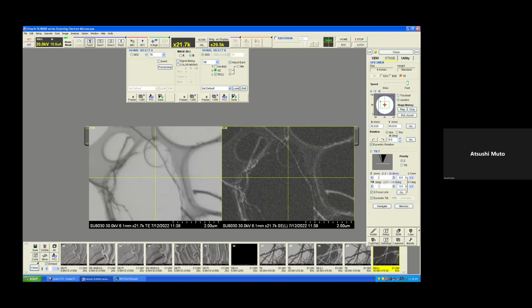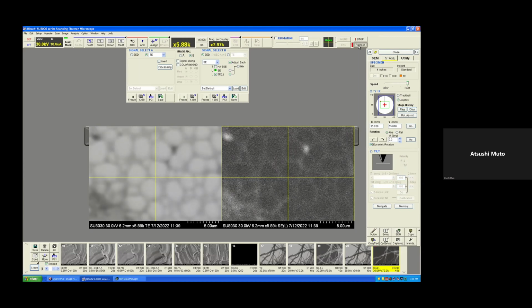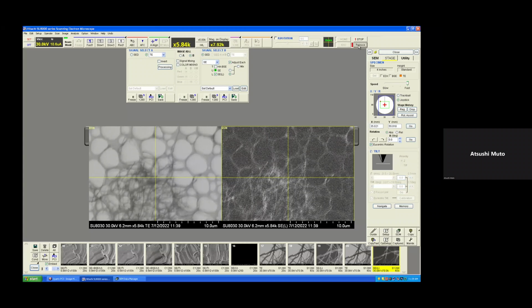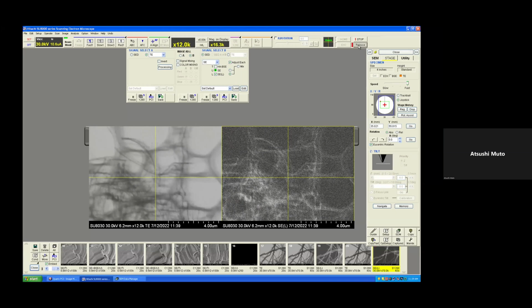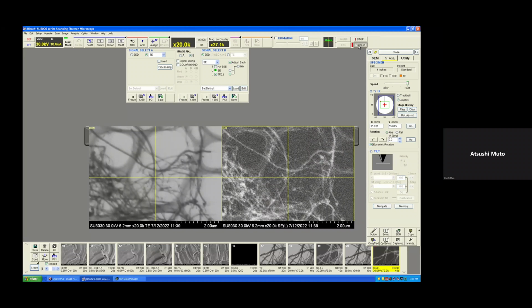And the next, let's make a stage lock. This stage lock is a function giving additional stability to the stage. Once we set the button, the sample is moved, but if you wait for a while, the stage becomes very stable and very strong against vibration and acoustic noise. I'm happy to operate in this Nuance Center's room. It's a perfect circumstance, but the stage lock will give additional help to get a stable image.